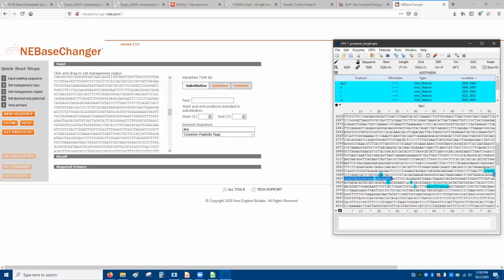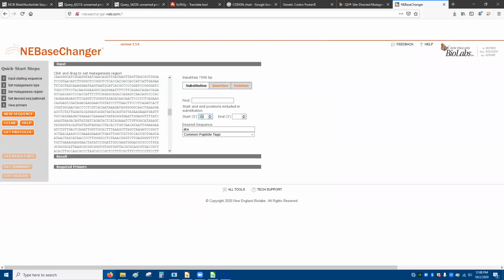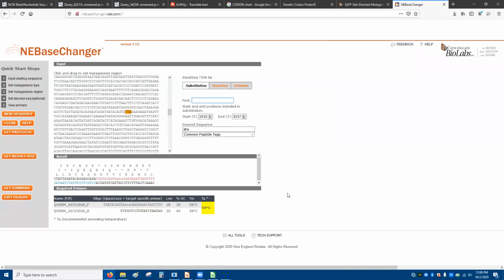Okay. So let's just delete this real quick. No, we can just do Control Z, get that back. So 3535, 3537. There we go. This should be correct.